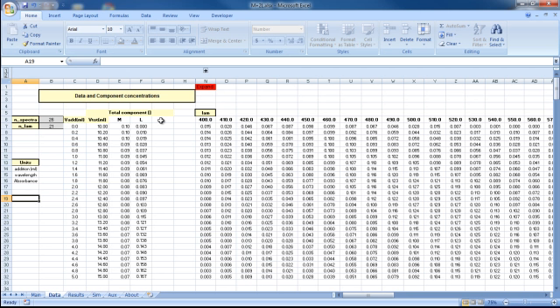As was discussed earlier, by leaving VTOT blank in the main worksheet, the user can provide these values manually for pre-prepared samples. This must be done after model compilation, since ReactLab will determine the component names and provide these as the column headings.